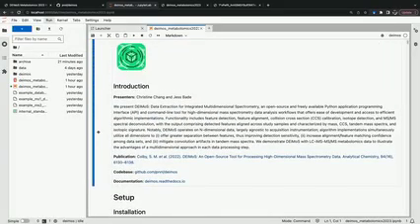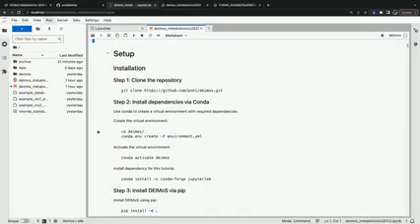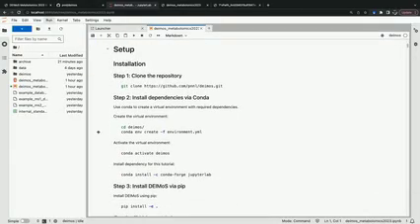DEIMoS is also fully open source and publicly available, and the link to the GitHub is there at the PNNL, Pacific Northwest National Lab GitHub repository. And we also have pretty extensive documentation that was prepared by our lead developer, Sean Colby, who isn't here today, but that's available through Read the Docs. And so we've just included some setup instructions for those following along currently or in the future at home.